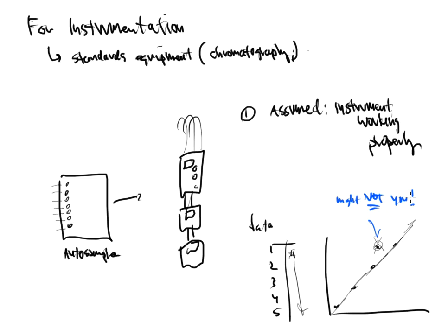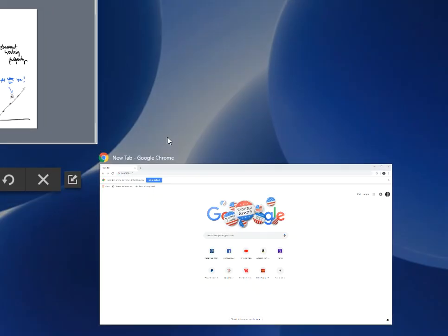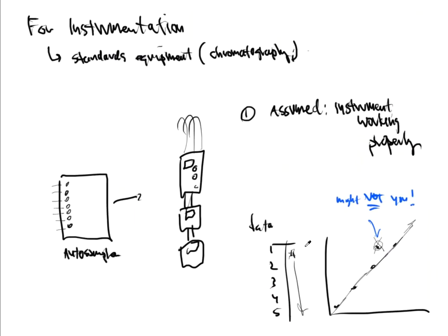All right, well, if we don't do internal standards, we would never know this, right? If we just had you make a set of standards and that was it, just one set of standards, and we had you inject those standards, and we called it a day, we would have no clue that the instrument had malfunctioned at any point in time. Now, for the calibration set, not too big of a deal, right?